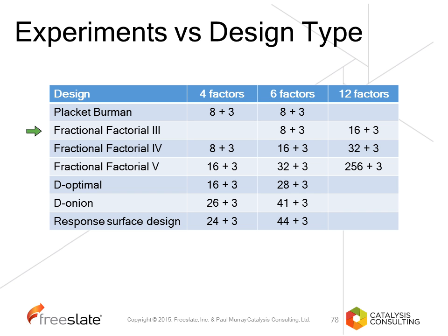The resolution 5 design will provide the maximum information that you're likely to want, so it will explain clearly which factors are important and their interactions. But if you have 12 factors, that requires 256 experiments. And that is too many experiments to be able to interpret, or to be able to carry out. So a resolution 5 design will allow you to get the maximum data from this.